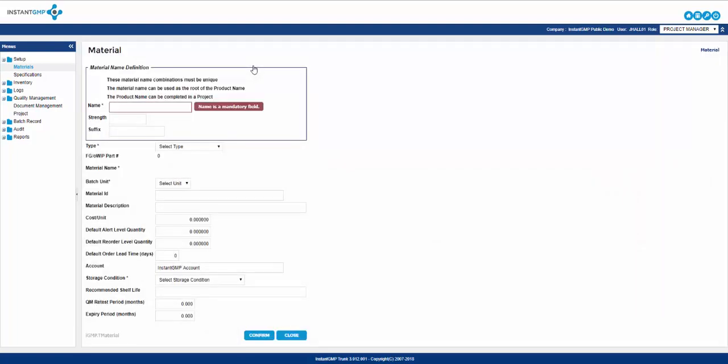We'll start by adding a final good. The first box you are presented with is the material name definition. The box lined in blue is unique for OIPs and final goods. Now, if your product has a strength denomination for pharmaceuticals or ingestibles that are required to list this property, you would list it here. Suffix is a supplemental modifier that allows for uniqueness. These three boxes, along with the type and batch unit, help create unique modifiers so the system can create different part numbers for similar products.